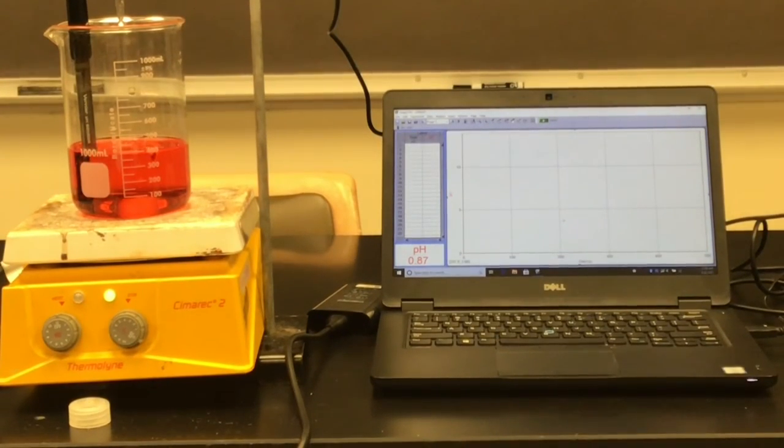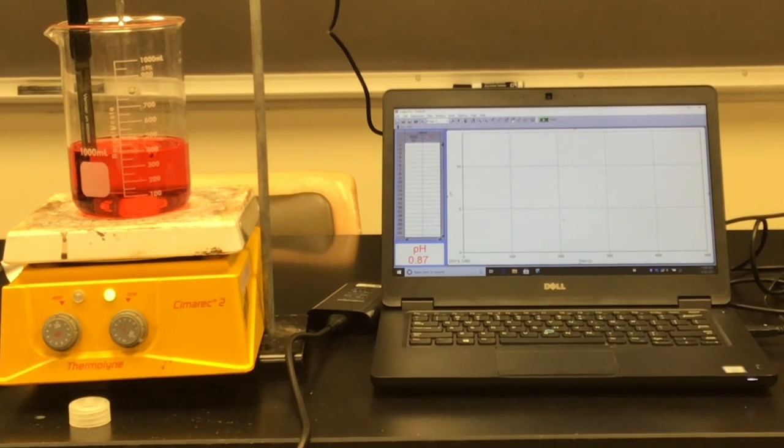So let's go ahead and do the experiment and see what happens. You kind of need to be a chameleon here. You kind of need to watch with two sets of eyes. You need to watch the color change, and you need to watch the graph as it goes, because the graph is telling you what the pH is, but also the color is telling you what the pH is.